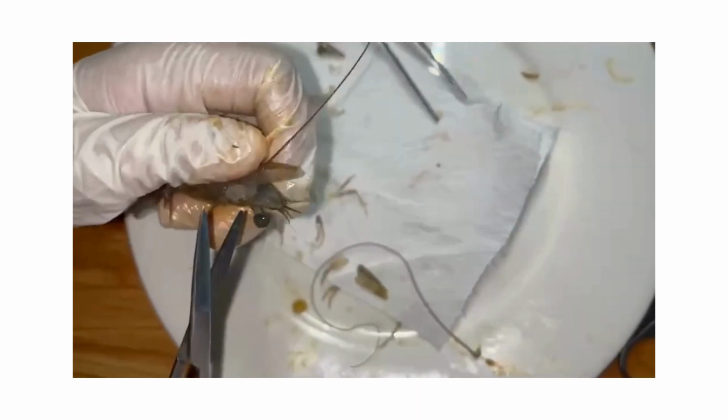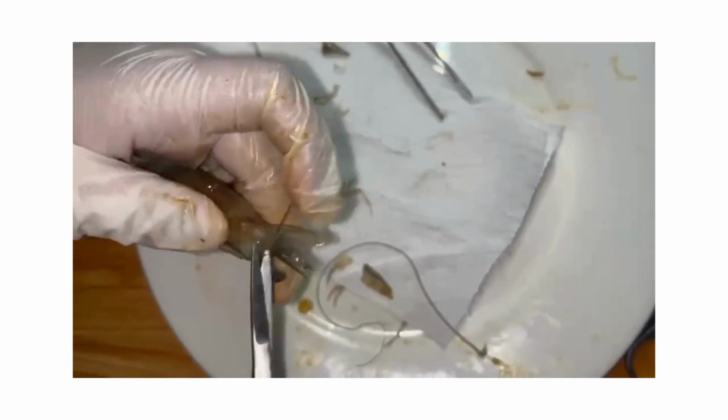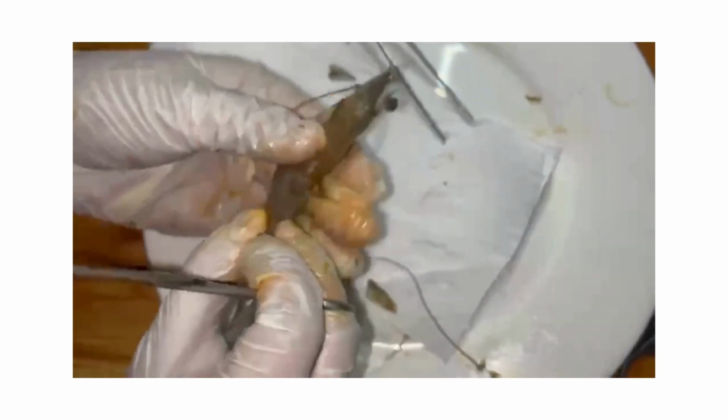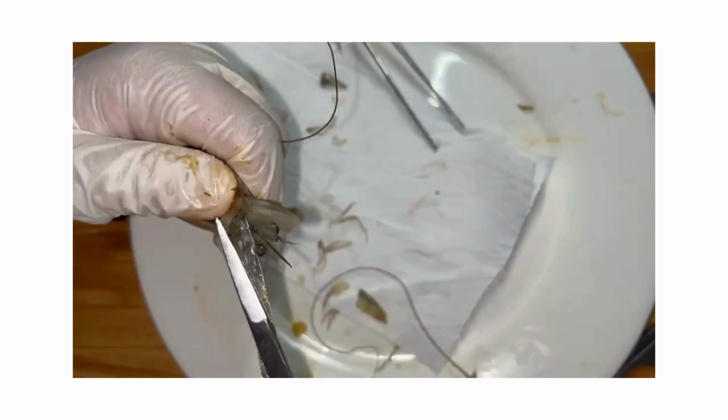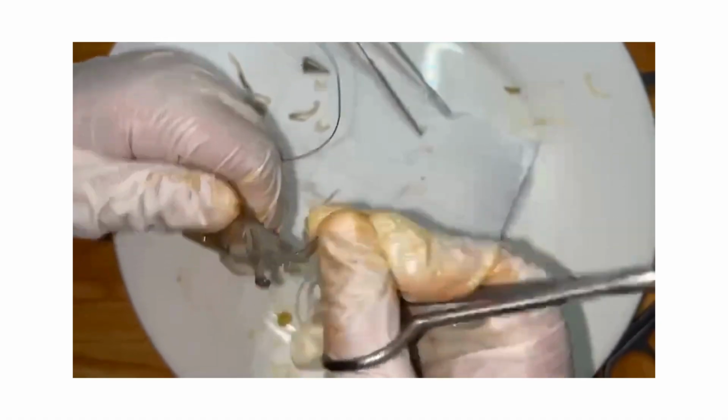Next is the removal of the antennules. To dissect them, carefully snip each antennule at its base. Removing the antennules helps open the view of the shrimp's head region, making it easy to study the location of the brain, mouth, and other sensory structures.